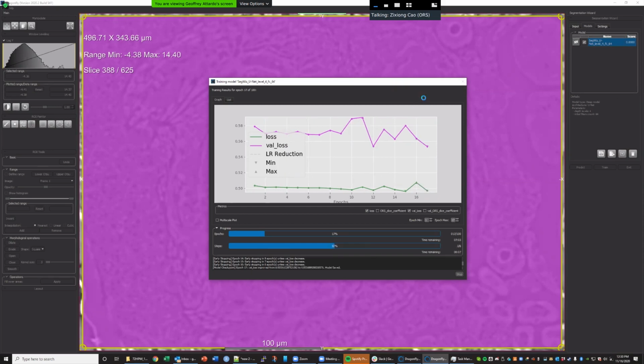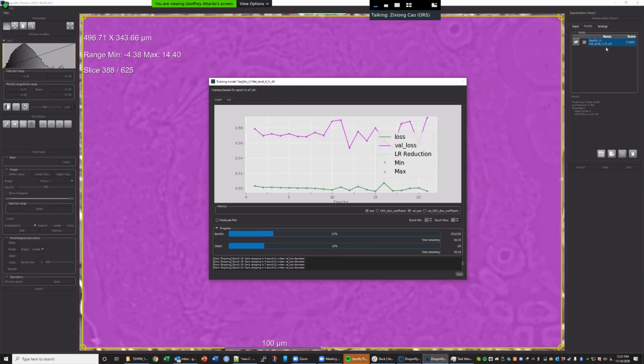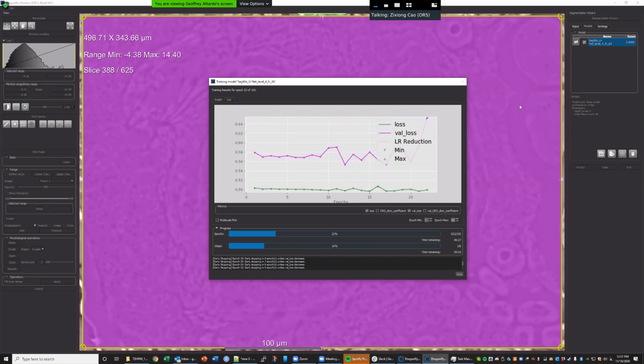And in Wizard, as I said, when we exit, the wizard saves everything in the wizard object. But if the model trained in wizard is good for you, and you want to use the model for the whole volume, you have to save the model first, so you can use it in the main context.